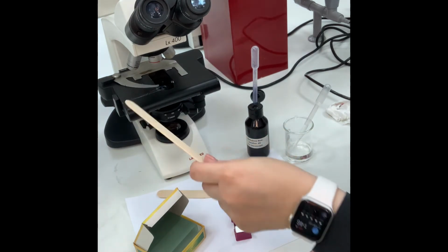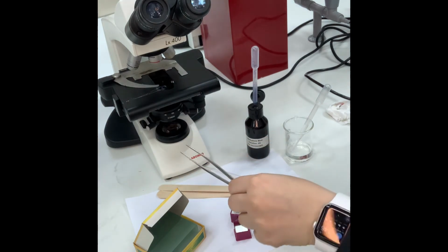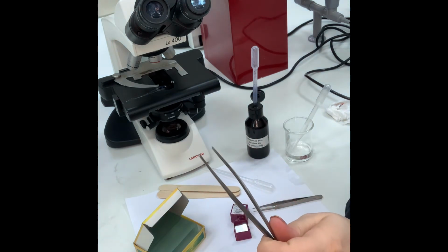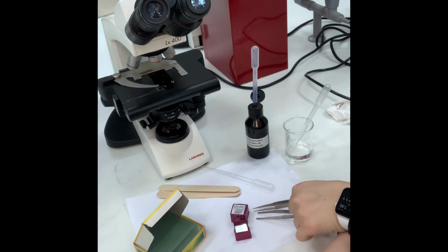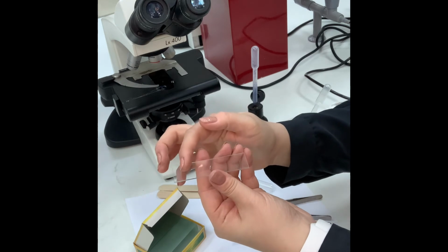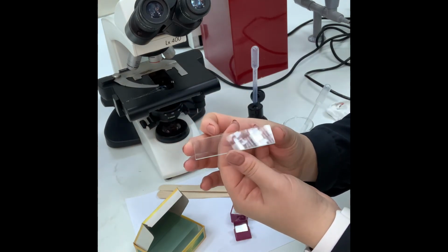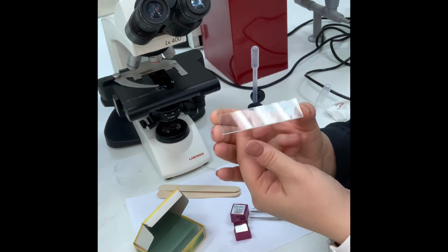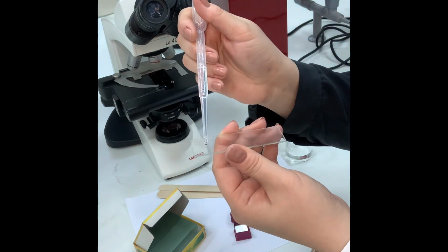For cheek cell, I need a wooden stick. For any other sample, I need forceps or tweezers. So mainly, these are the materials needed. To prepare the sample, very simple. I will add a drop of water and a drop of stain on the same slide, just not to waste my time doing many slides. I will just do it in one. So I will add one drop.